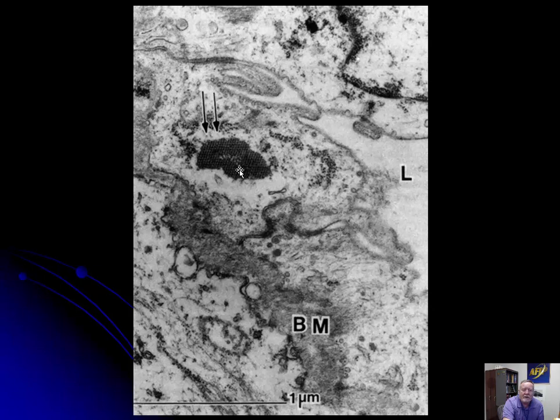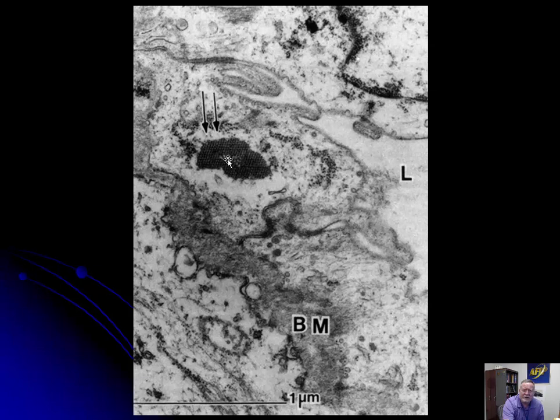Rodents are the one species that develop brain lesions as well, and they're also the host for that particular virus. If you look very closely, you can see the paracrystalline array. Most viruses that proliferate in paracrystalline arrays are DNA viruses, but this picornavirus is an RNA exception.